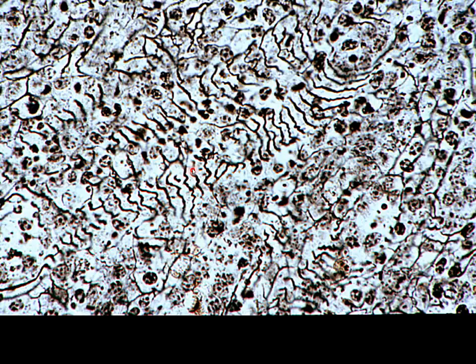Here we can see these perpendicular fibers. This would be our splenic sinus running in this direction. So the cellular components would be parallel in this long plane, but there are reticular fibers holding those stave cells together. So this is a splenic sinus. Here we have a splenic sinus. There we have another splenic sinus. And the space between would be where we have the cords of Billroth, or the splenic cords.